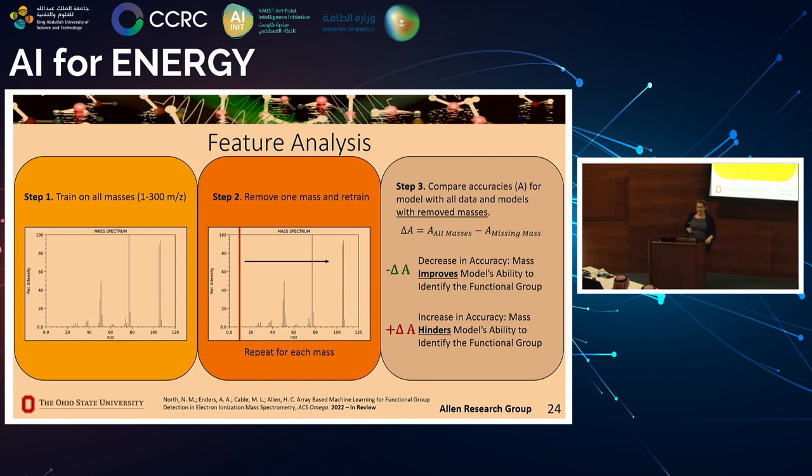The idea for this process actually came from our understanding of convolutional neural networks and neural networks in general. There's a concept called dropout nodes, and the whole goal is to randomly turn nodes on and off to ensure that your model is not relying too heavily on a single node in your network. This makes sure that if you have many nodes and a high level of computational complexity, you're using all of it because you're training all of it. So the question became, if you have something really simple, for example a logistic regression model, how can we do a similar knockout and make sure that no one piece of the puzzle is dominating the entire system?